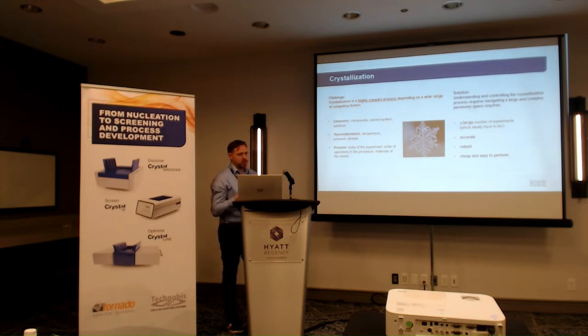And working at smaller scale can sometimes give completely different results than moving up into pilot plant or even 100 milliliter scale, just because the level of control is a lot less when you go up in scale. So how do you address and investigate this complexity? That comes from understanding the full landscape of the crystallization process. But in order to do that, you need a large number of experiments, which means it needs to be cheap to run. You can't be doing 100 experiments which cost $1,000 or euros a pop. They need to be accurate, robust, reproducible every time, and easy to perform.